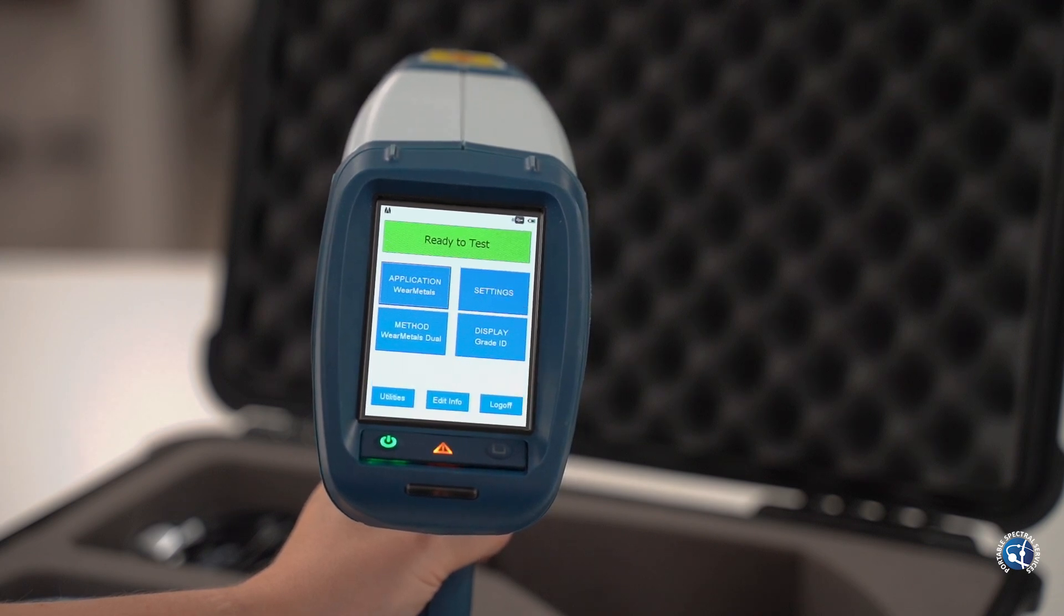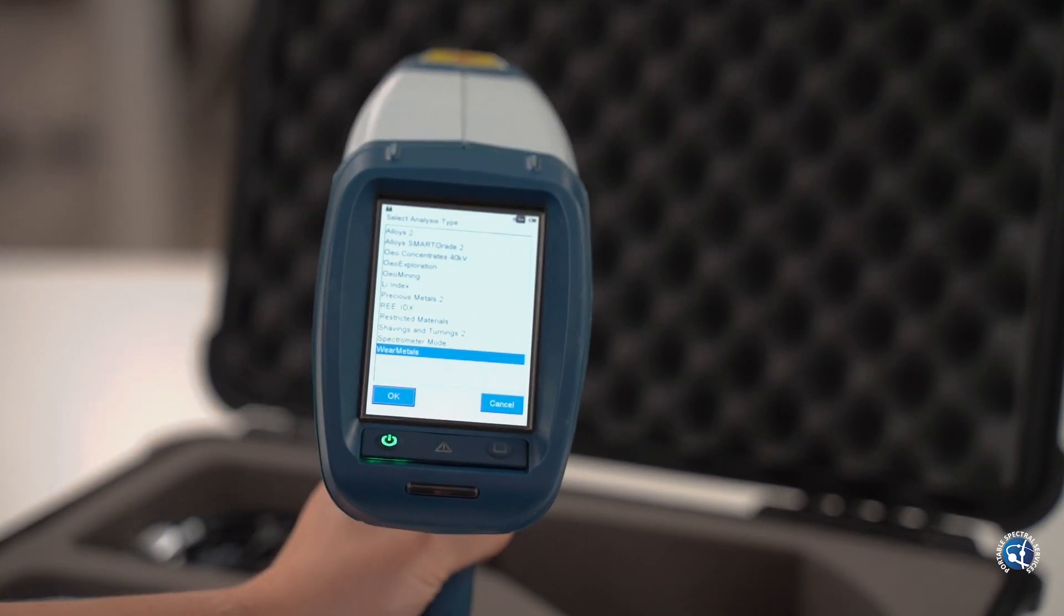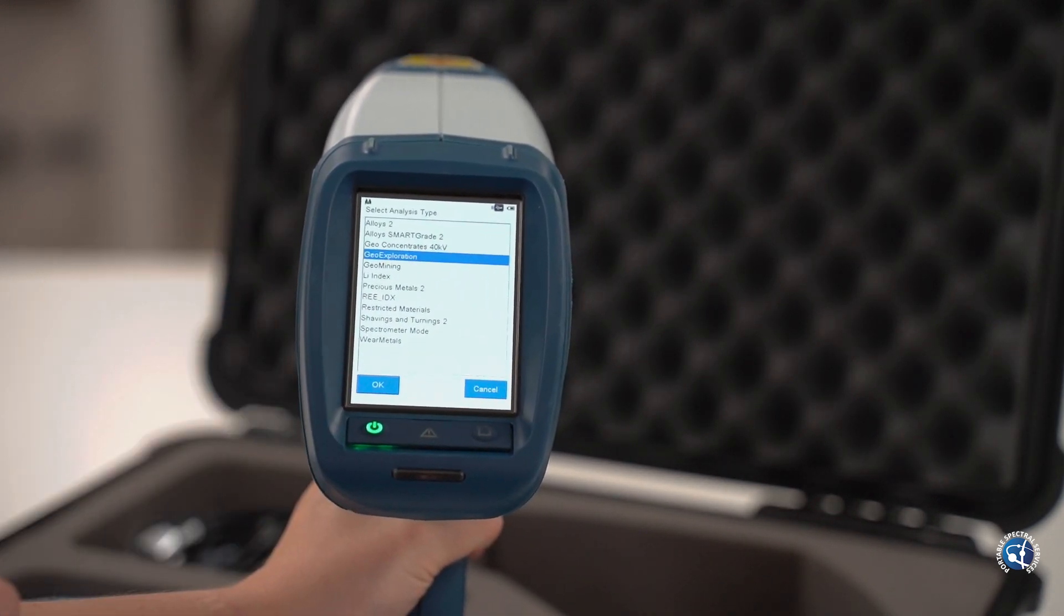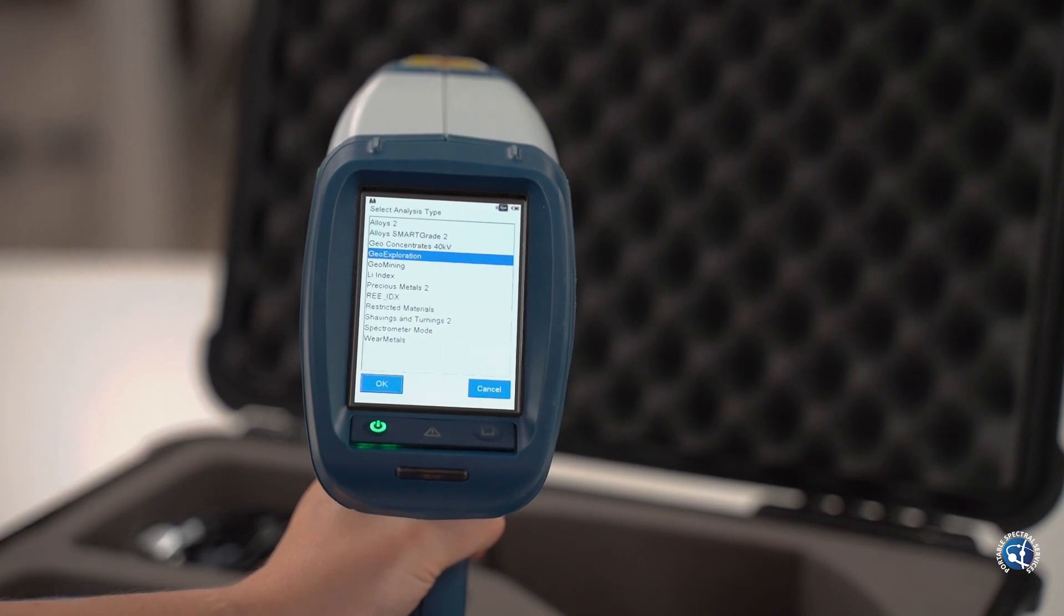To do this you go into application, click on the calibration type you want and confirm by pressing OK. This will then take you back to the home page.